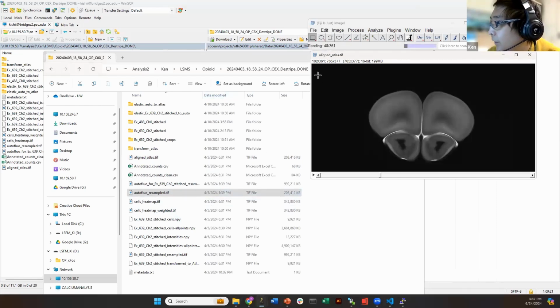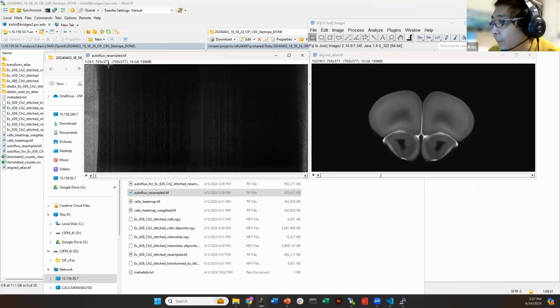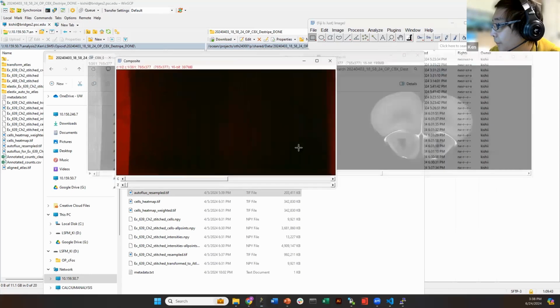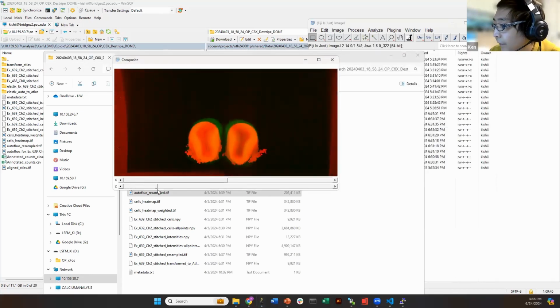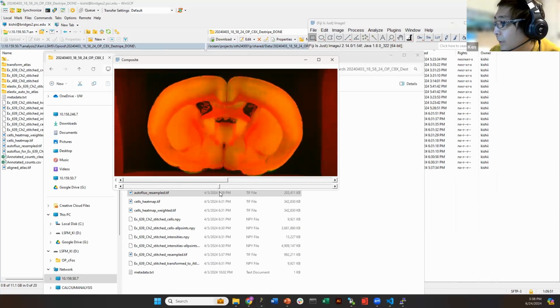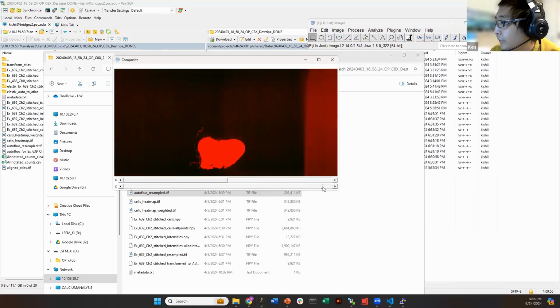If you also load this onto ImageJ, you will have 2 files that have the exact same shape, 361 Z-planes, 765 by 377. If you overlap these 2 images with an ImageJ function in red and green, you will have something like this, which is showing the overlap of the red images and the green images.